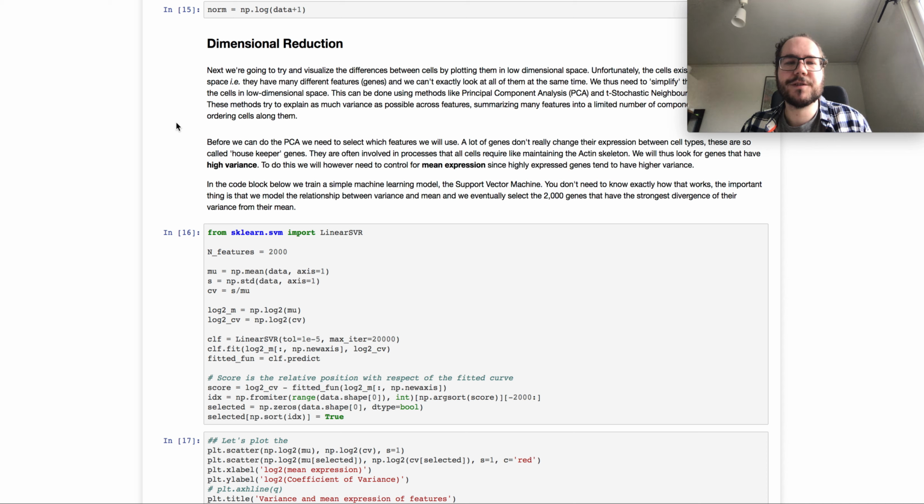So you can imagine, for instance, here in this data set, we have developmental data from the mouse cortex. So you would expect to see, for instance, less developed neurons and more developed neurons. So one source of variation that you would expect to see in your data is this maturation of neurons and the different transcripts that will be becoming active or that will become inactive during this process.